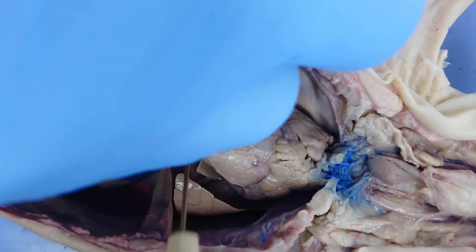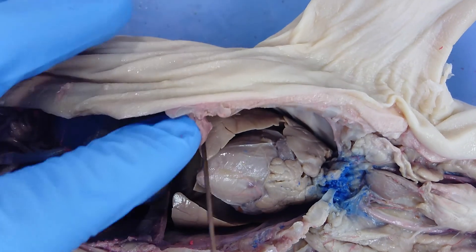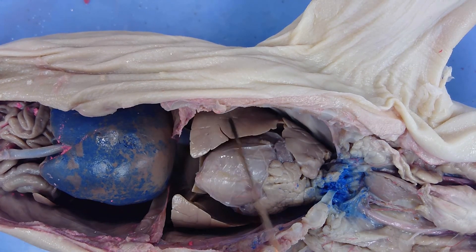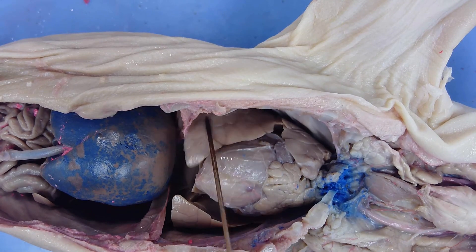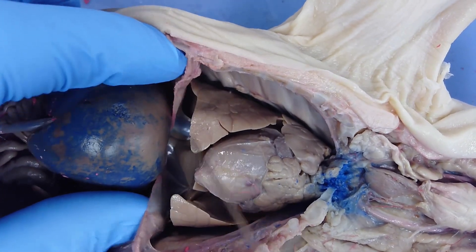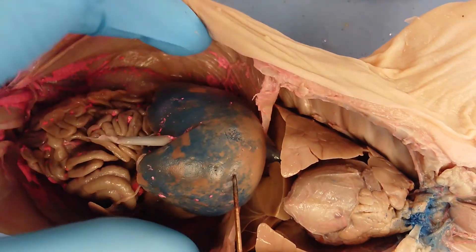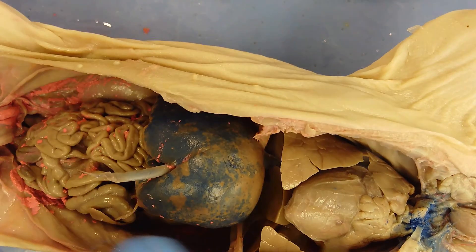There's a thin membrane separating the upper thoracic cavity from the lower abdominal cavity called the diaphragm. It's how the pig draws air into its lungs: when the diaphragm is drawn down, it expands lung volume and draws air in carrying oxygen; when released, the lungs collapse in volume and air is expelled carrying CO2. This large structure dyed blue is the liver, one of the largest structures in the abdominal cavity. The tube extending from the liver is the umbilical vein, which you cut when you peel back the umbilical cord.